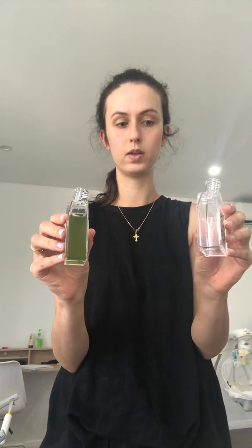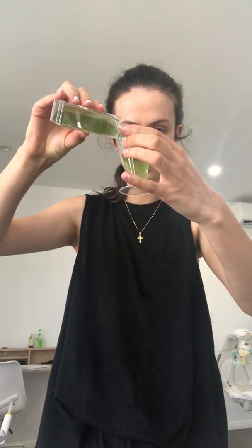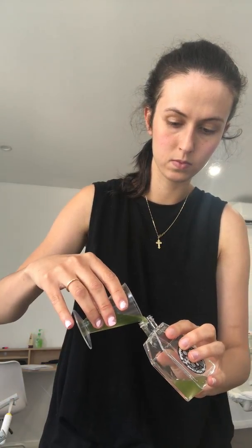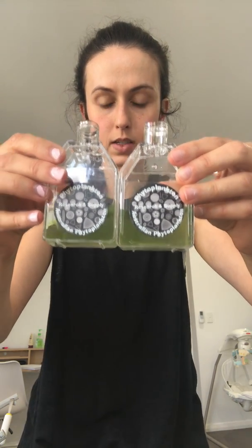All we're simply going to do is put half of this into the second flask. This is 50 mils, so we're going to put 25 mils into here. I'll measure out 25 mils and pour that in. There we go — two separate batches of the same amount.